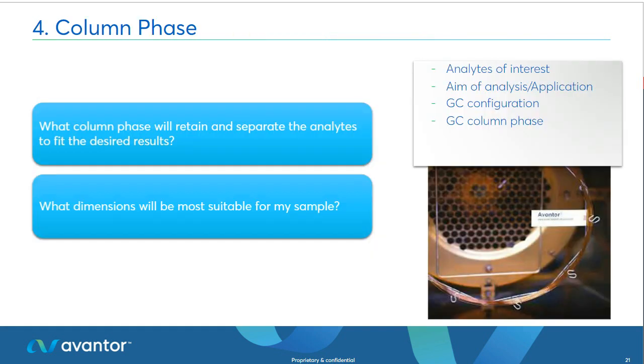Column phase. So what column phase will retain and separate the analytes to fit the desired results? So what phases are going to work for what you're trying to achieve? What dimensions are also going to be suitable for your sample? Very important point to consider.